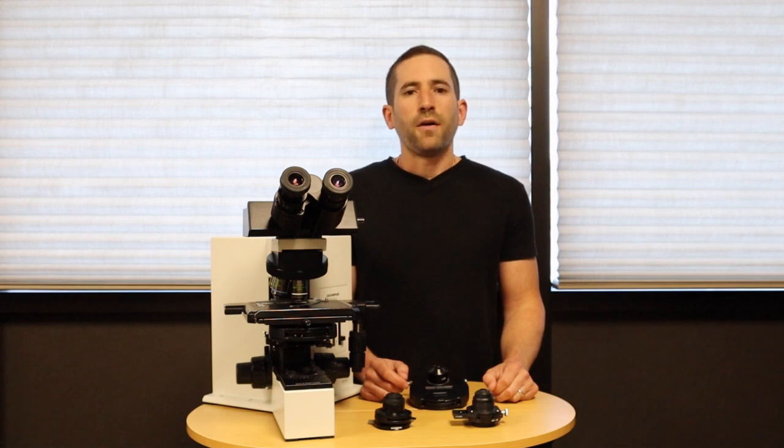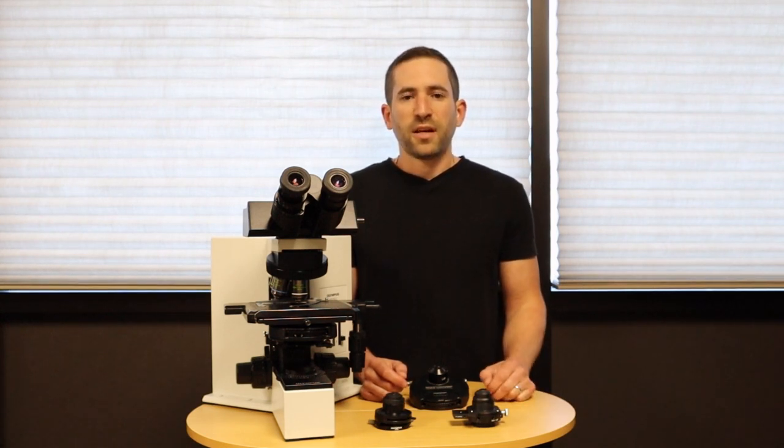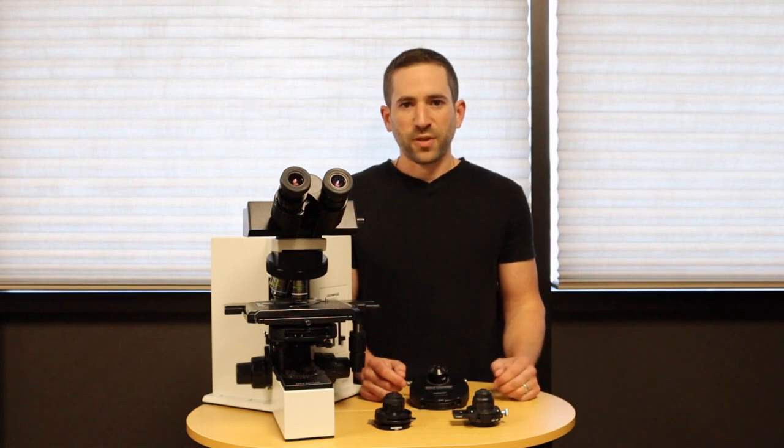Microscope Central has a wide selection of new and refurbished phase contrast microscopes suitable for wastewater treatment. We can add a digital camera to any of these microscopes. Please contact us at Microscope Central for your microscope-related needs.